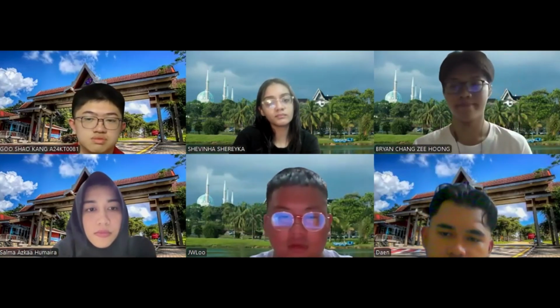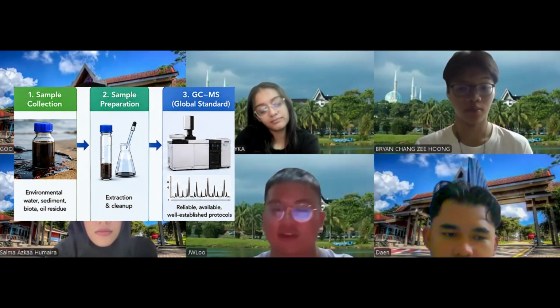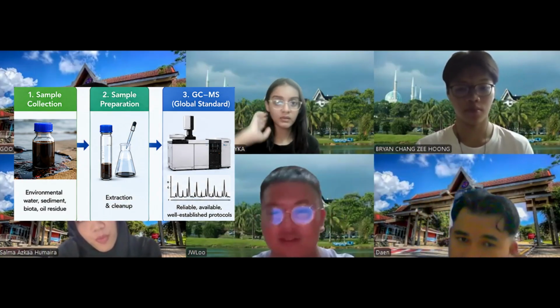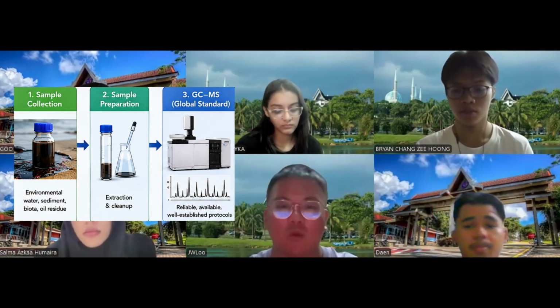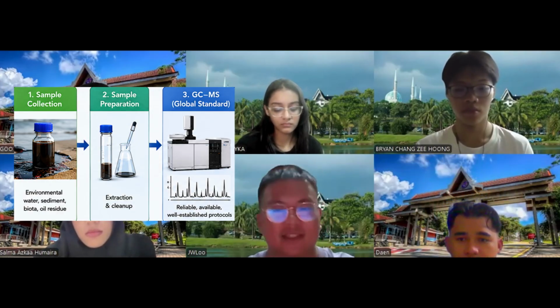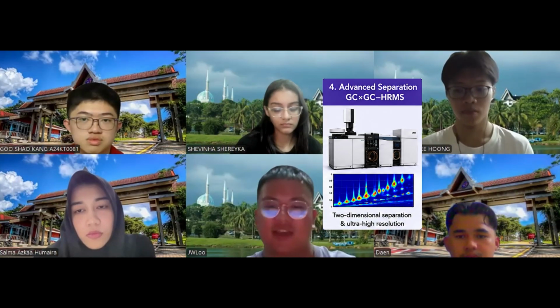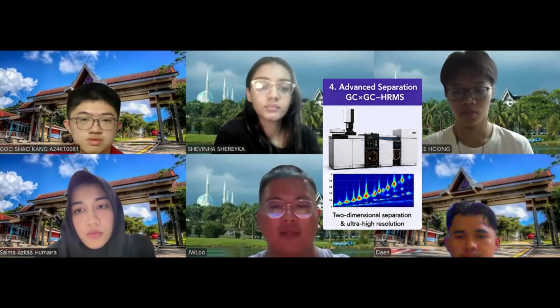Thank you for sharing, Adain. I very much agree with you. While GC-MS remains the global standard in oil spill forensics due to its reliability, availability, and well-established protocols, it does have some limitations when dealing with highly complex or weathered samples. So in order to enhance the analytical accuracy, it's often combined with more advanced techniques, for example, GC×GC-HRMS, which provides two-dimensional separation and ultra-high resolution for complex hydrocarbon mixtures.